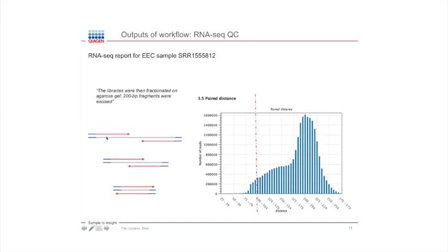And so long as my fragment is longer than the length of a read, which is the case in this first and this second case, then everything that I sequence will be RNA, and everything will go fine. What you can occasionally find is that you have a fragment that's shorter than the length of the read, and the reads are 100 long in this case. And then the read will read across through the whole fragment and into the adapter region. And then you'll get some adapter contamination at the end of your reads.